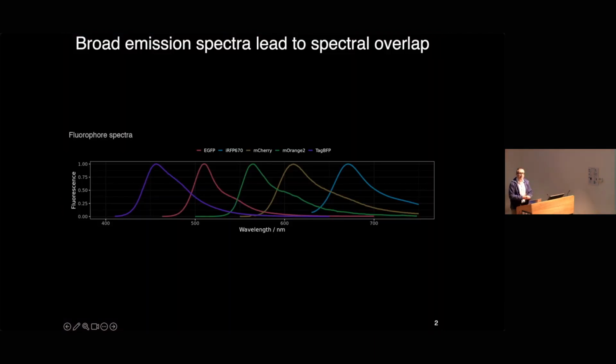One of the great things about fluorescence microscopy is that, of course, fluorescence is available in multiple colours. So this means you can take component A of a cell, label it in green, component B, label it in red, component C, label it in blue, and then when you see blue, you're seeing that third component. But there's a problem in that we're using molecules for fluorescence, not atoms, and so this means that the spectrum of that emitted light is quite broad.